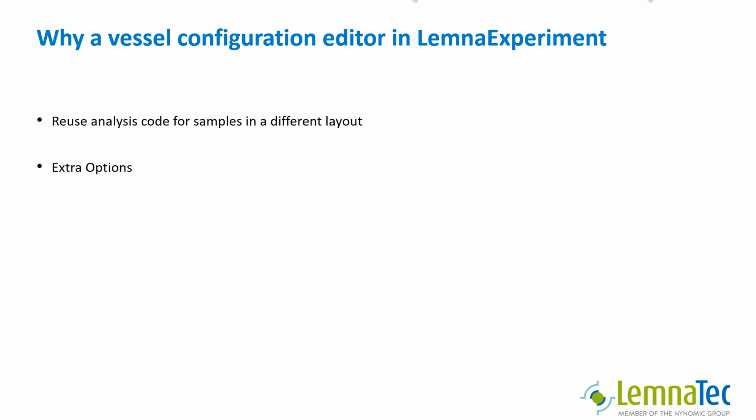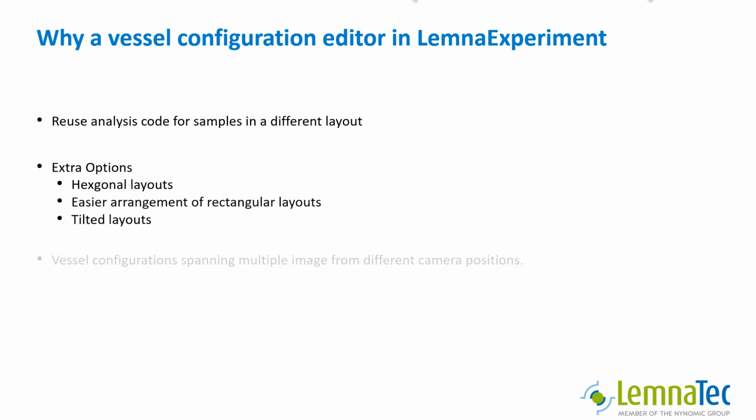The vessel configuration editor of LemnaExperiment has some additional features. It supports hexagonal layouts of samples. It has an easy arrangement in rectangular and hexagonal grids, including tilted grids. You can create vessel configurations spanning multiple images if a vessel is not recorded into a single image. So you see there's a couple of scenarios where the vessel configuration editor of LemnaExperiment can be useful. So let's have a look at it.